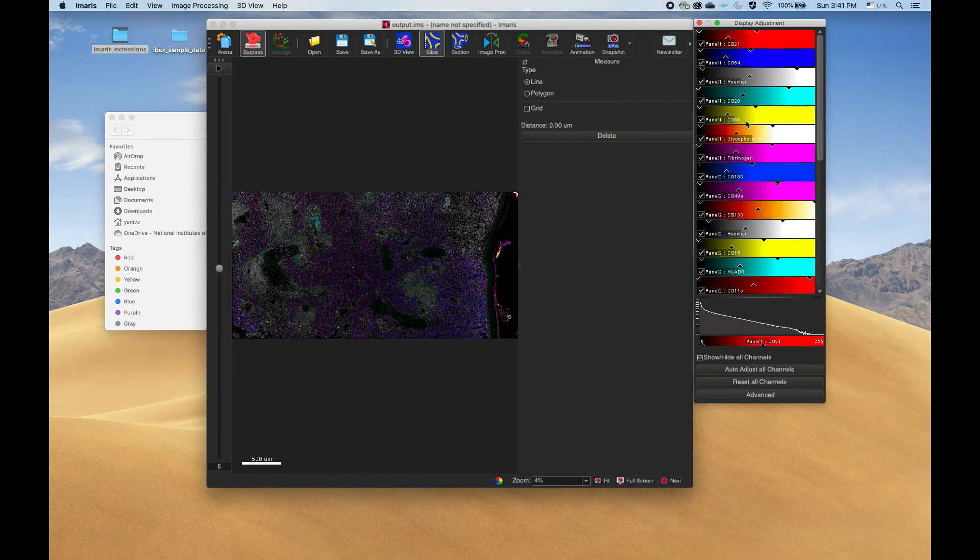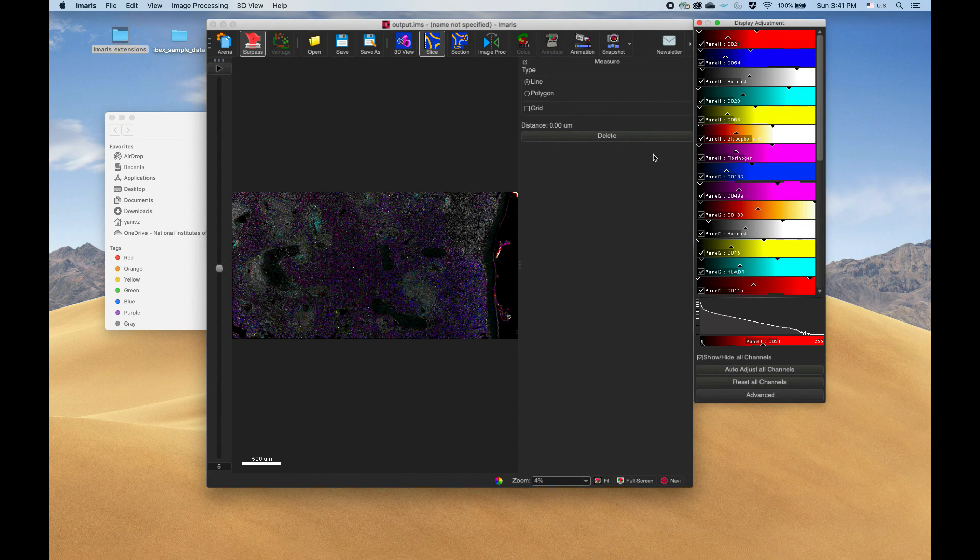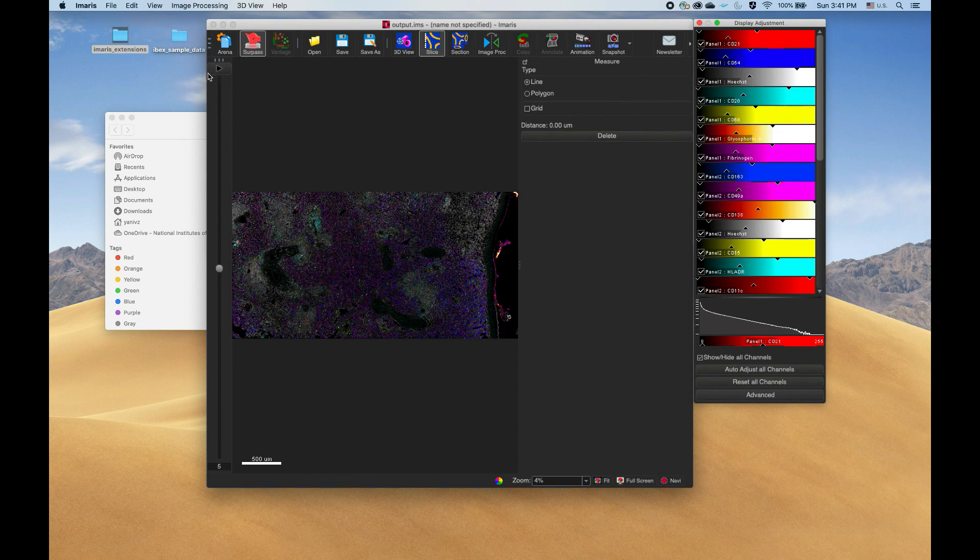From here on, you can analyze all of the information in one panel. Hopefully you enjoy the usage of the SimpleITK MRS registration extension.